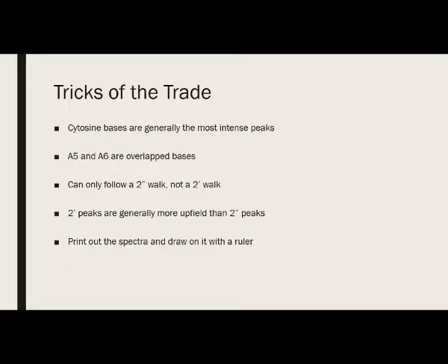And here's just a trick for you. It can be really helpful to print out the spectra and use a ruler to draw lines between bases and to scribble notes on, while also having the spectra on the computer screen to get a closer look if needed. This almost dual screen option is really helpful when trying to distinguish between two very similar bases. Lastly, it's a great idea to keep a running table of peak assignments just so that you don't get confused when you're making your peak assignments.